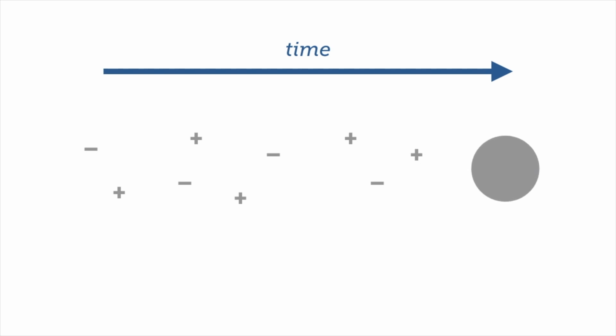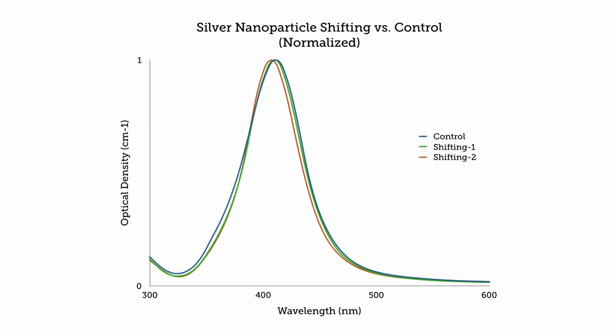As I discussed earlier, smaller nanoparticles will absorb the shorter wavelengths of light, which explains the blue shifting that we see here. The decrease in overall size is verified by TEM image analysis of this material to be a decrease of about 3 nanometers. Additionally, as silver ions are released from the surface, morphology of the nanoparticles will change as slight imperfections in the facets may become smoother, or the particles can become more spheroidal, which can result in the narrowing of the spectrum, as we see here.